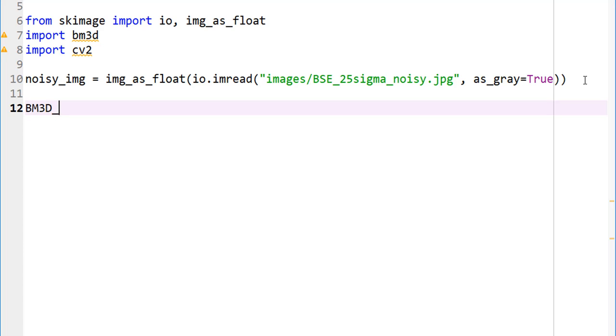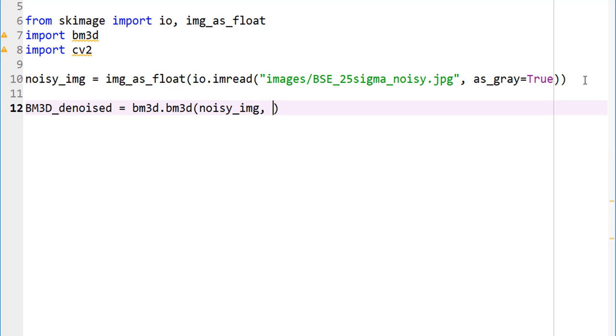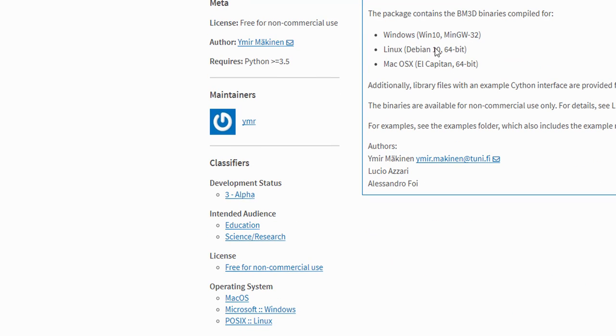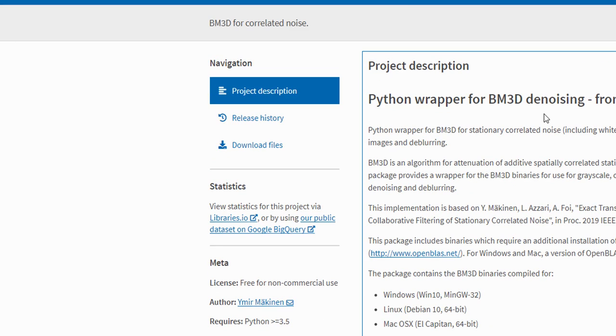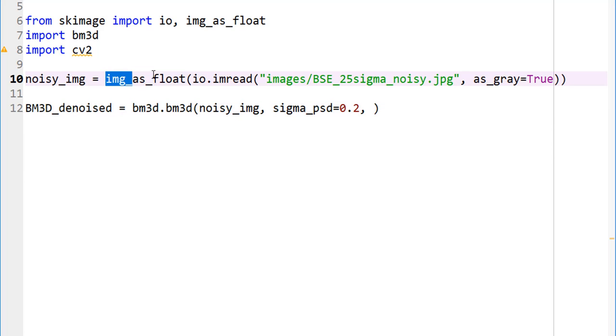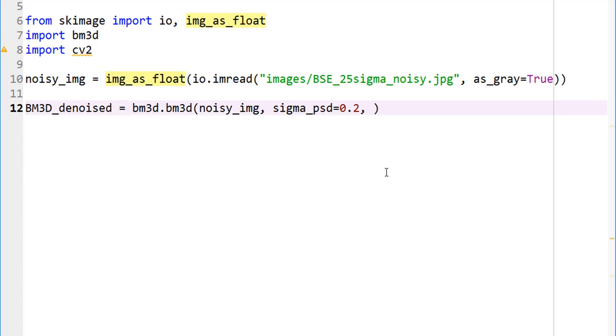Now we imported our image and we are all set. Let's do our denoising: BM3D_denoised = bm3d.bm3d. What did we call our image? noisy_img. The second parameter is sigma_psd. By the way, one thing I should mention is this is so new it's not very well documented. What I did is I downloaded the source code and went through it. I realized there are a couple of things like sigma_psd, which is our noise standard deviation. Let's start with a value of 0.2. It's a floating point number between 0 and 1.